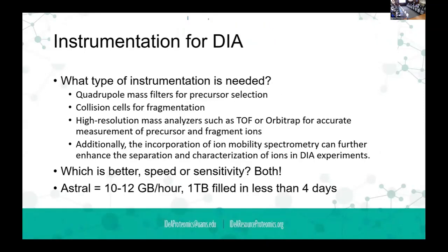There we go. Perfect. And so, this probably goes without saying, but what kind of instrumentation do you need? You have to be able to mass select, you have to be able to fragment, and then something high resolution, at least as of now.